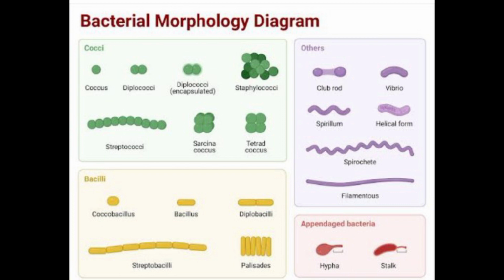In the modification, heat-fixed smears of the specimen or bacterial culture are stained with crystal violet primary stain for 1 minute. Dyes such as gentian violet or methyl violet may also be used as a primary stain. Pour Gram's iodine, a dilute solution of iodine, over the slide for 1 minute. Wash the smear with water.